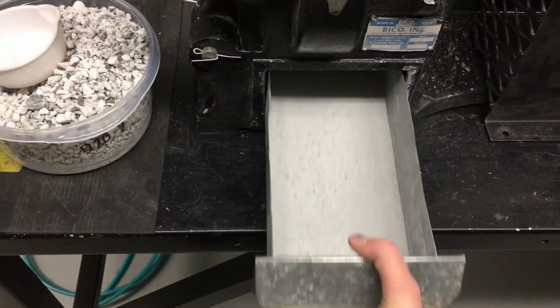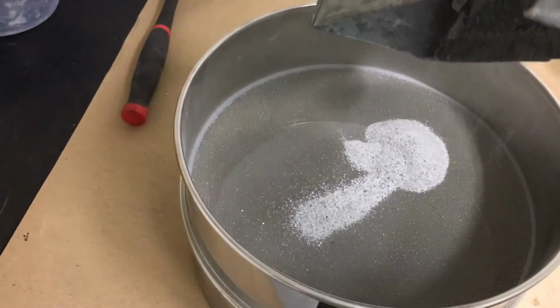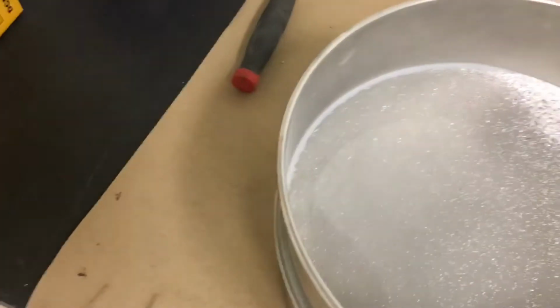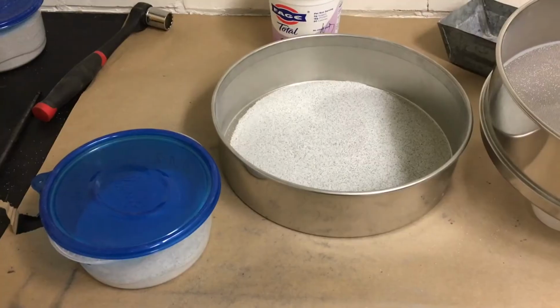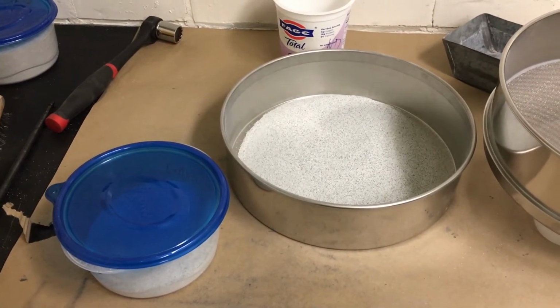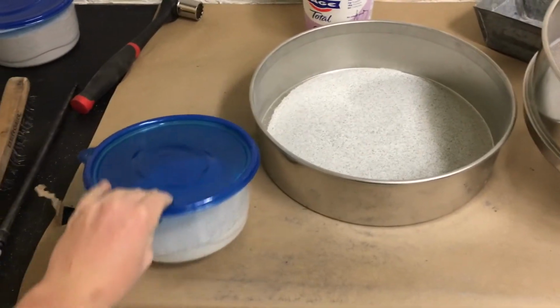Next, we'll take the sample over to the sieve, where we identify smaller than 500 micron grains. The sample that does not fall through the sieve will go back through the disc mill. Here we can see the sample that has fallen through the sieve is less than 500 microns. We will place the sample in the bin for safe keeping.